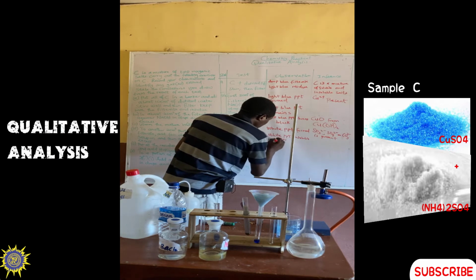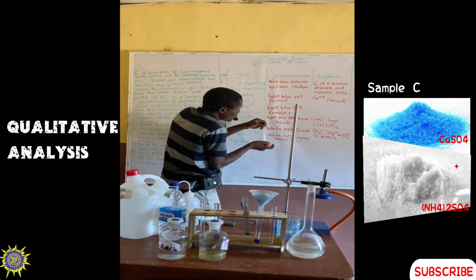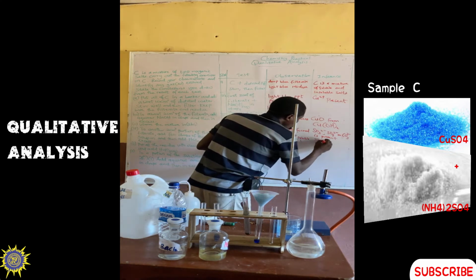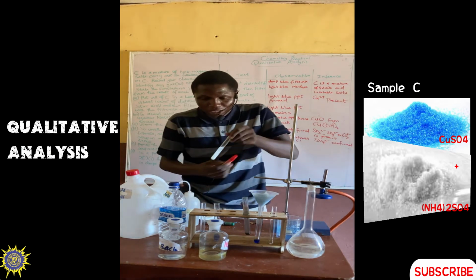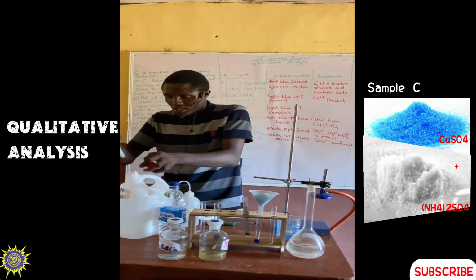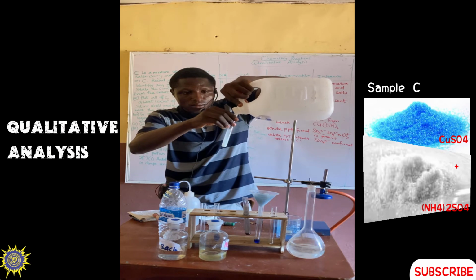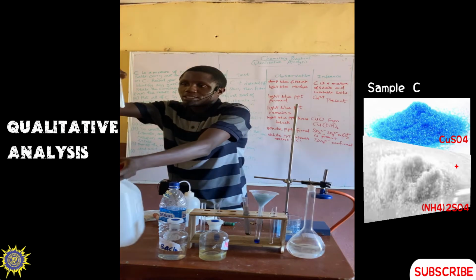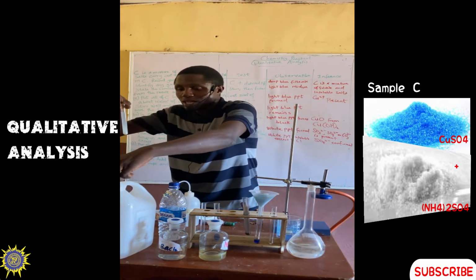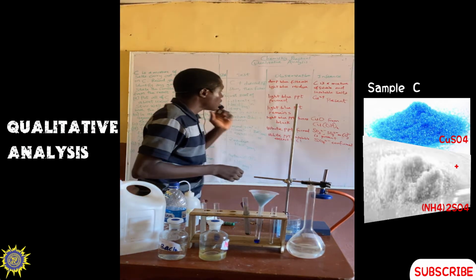In excess HCl, what are we going to have? When the white precipitate is insoluble in excess HCl, we are going to have SO4 2 minus confirmed. Now let me add more of it so that you can see what I'm trying to say. It's already in excess, but let us add more. You can see the white precipitate still persists, so it's insoluble. You can see the precipitate settling down here. So SO4 2 minus is confirmed. Now we are done with that.